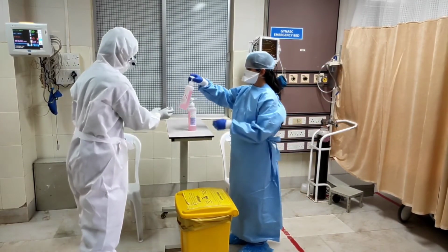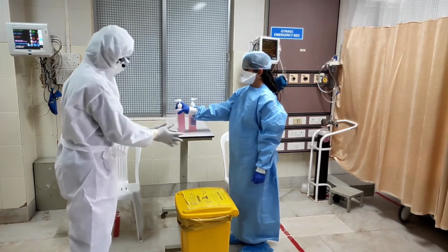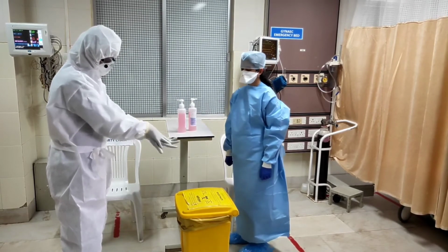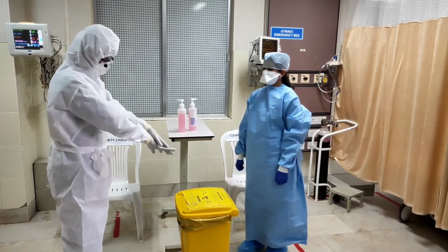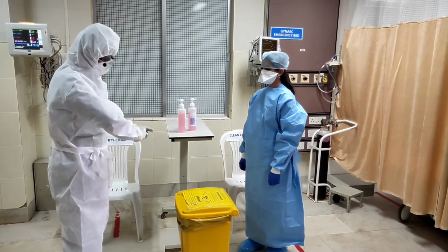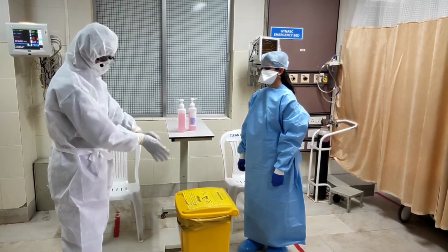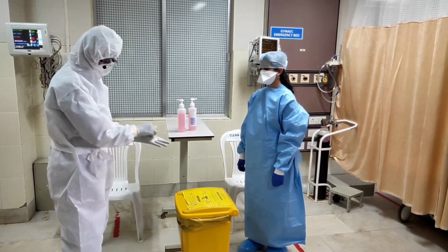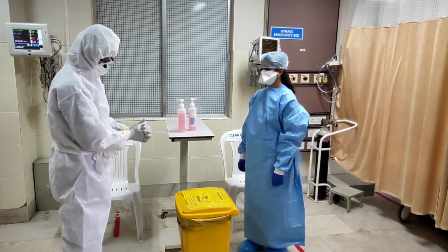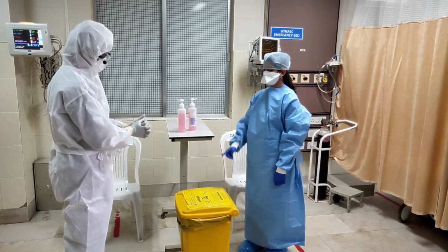The first thing to do is decontaminate your outer gloves by proper hand sanitization. Properly cover all areas of your outer gloves with the sanitizer and properly wash the hands. Once you have decontaminated your hands, the first thing to remove will be your shoe cover.